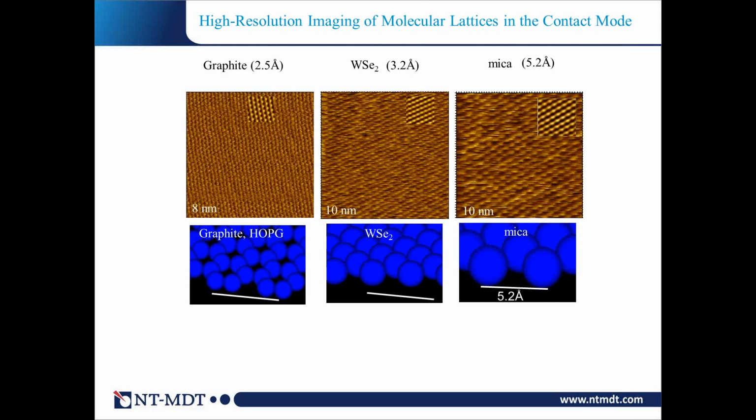First of all, everybody knows that life started with attraction in AFM, in particular in the contact mode, which was the primary AFM mode at the beginning. People could see single atoms. Actually, it was not atoms, it was lattices of layered materials which have smooth, atomically flat surfaces.